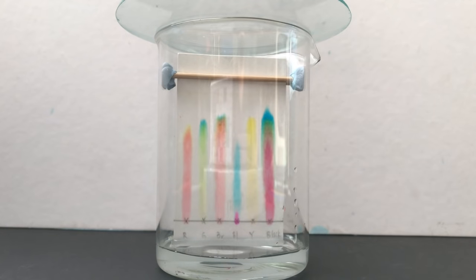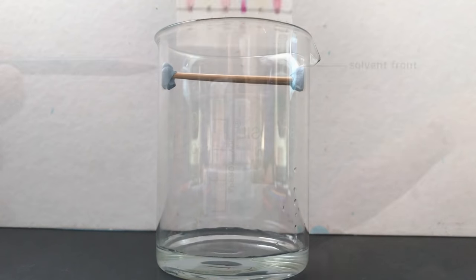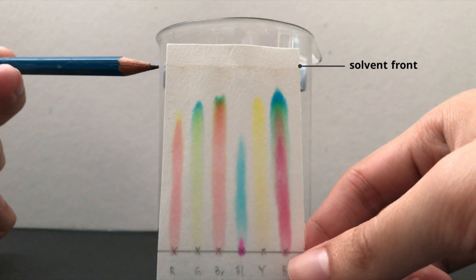Here, we see the solvent front moving upwards. When the solvent front has reached near the top, we then remove the chromatogram and mark the solvent front with a pencil line.